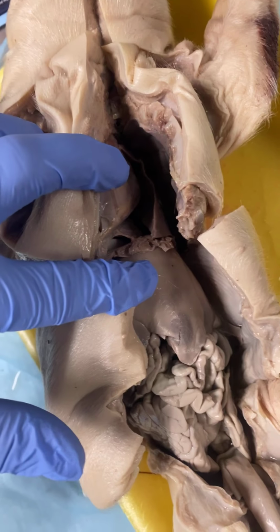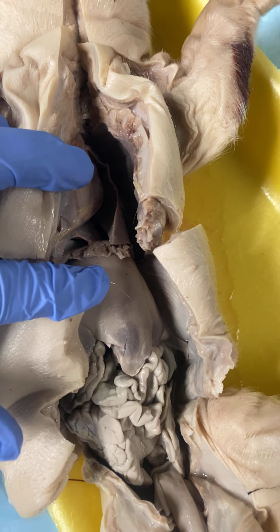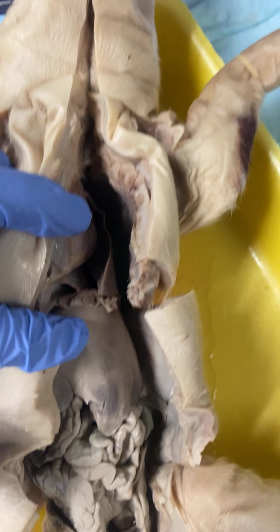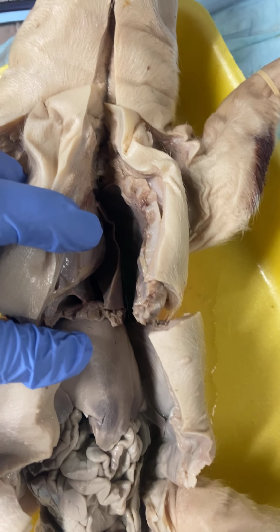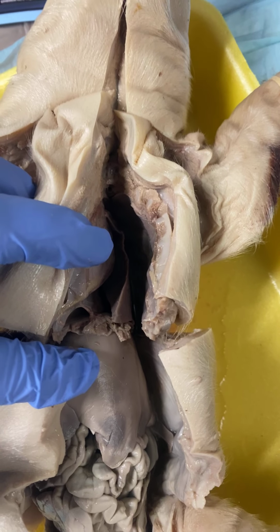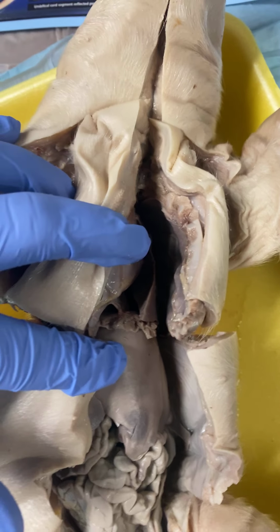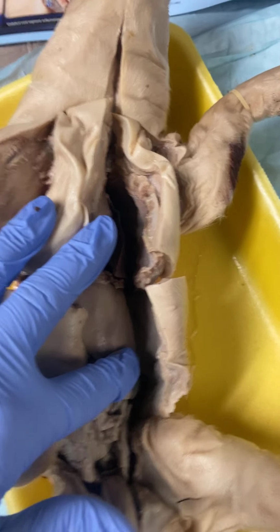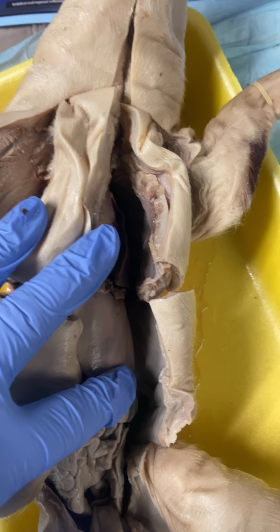Okay. Then right here where my pointer finger is the liver. And the liver is an accessory digestive organ whose functions include fat digestion and storage, bile production, glucose metabolism, and detoxification. Okay, and then back here where my pointer finger is again is the stomach.